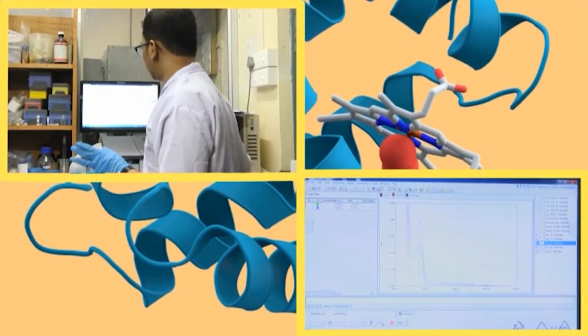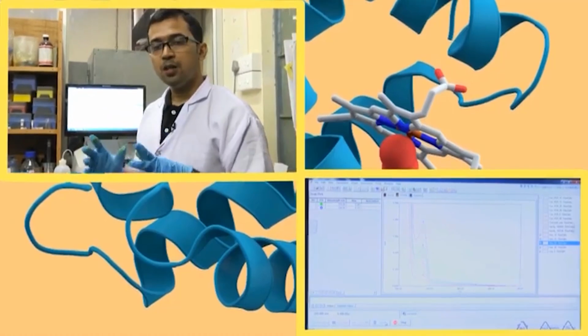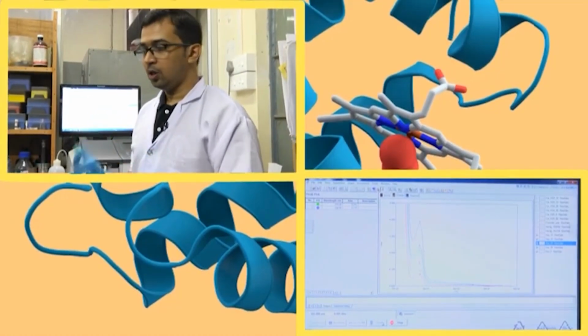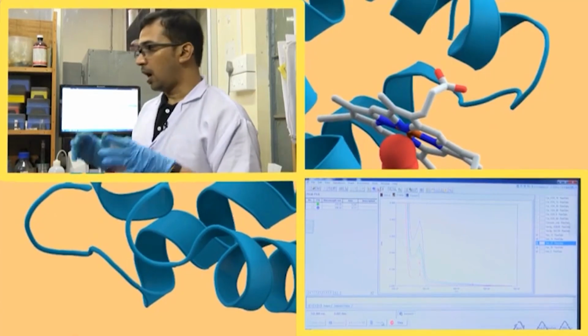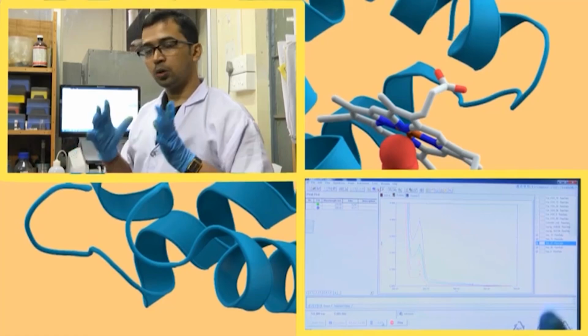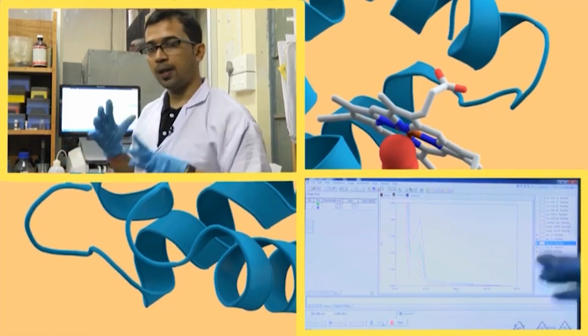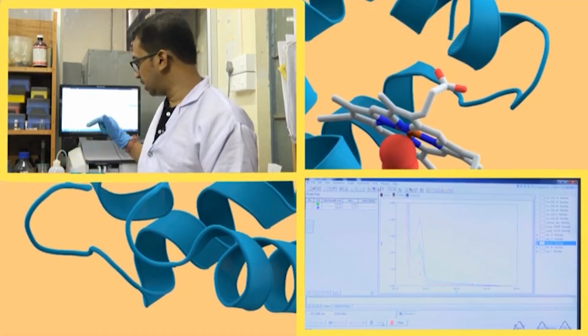So in V1 S1 = V2 S2, the final volume V2 should be 3005 microliter. Again, when you add 10 microliter of HSA, the final volume is 3010 microliter. This total volume should be taken into consideration while calculating the final concentration of HSA in the cuvette.